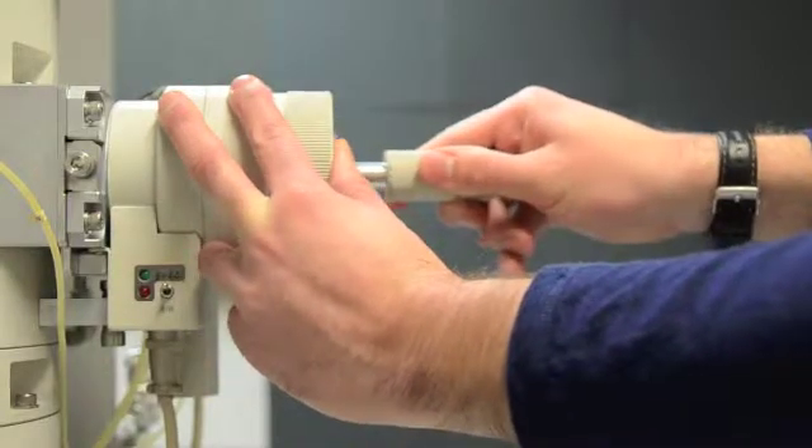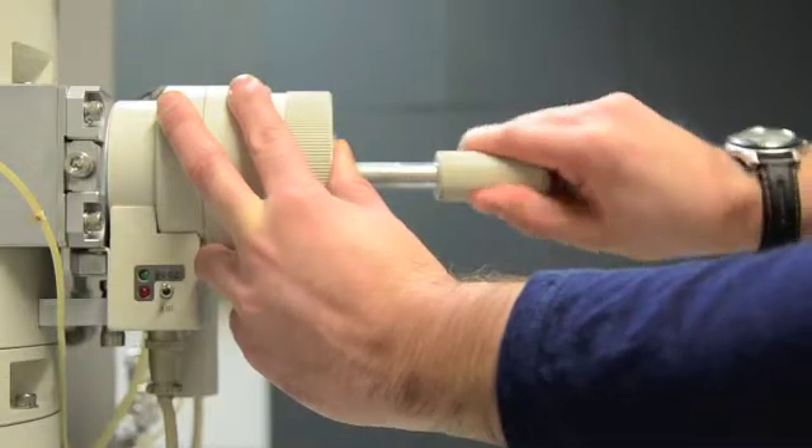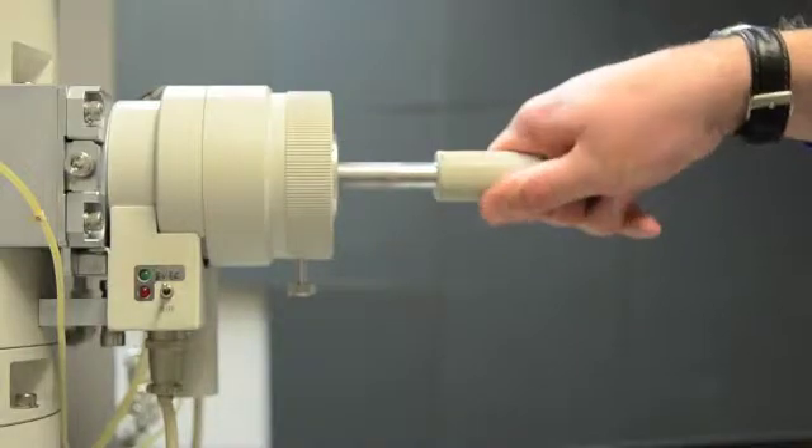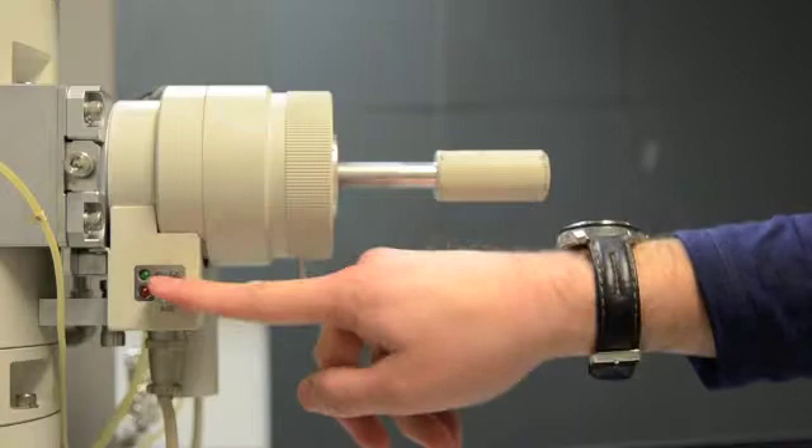You can now pull the rod out and rotate counterclockwise to position A. You will hear the click of an internal valve. Keep turning until you feel it stop, then switch the switch from evac to air.